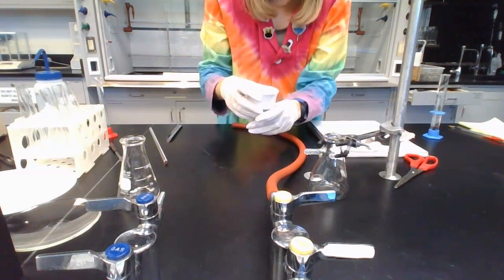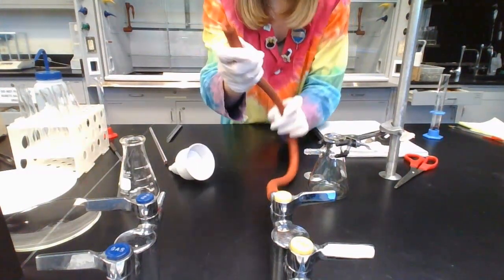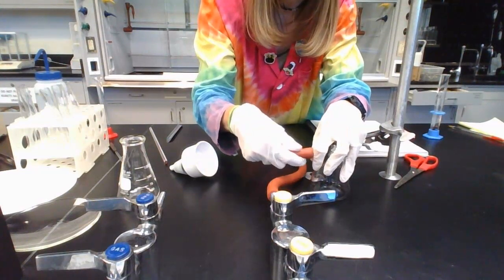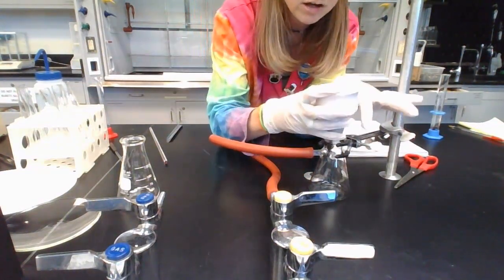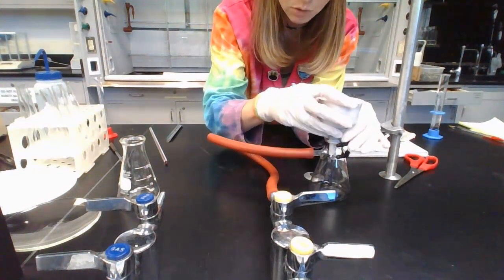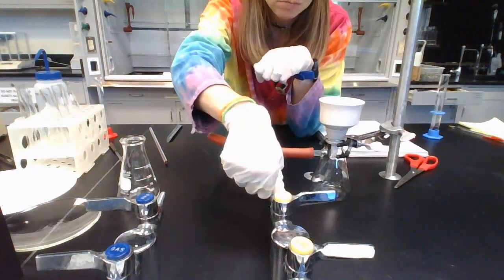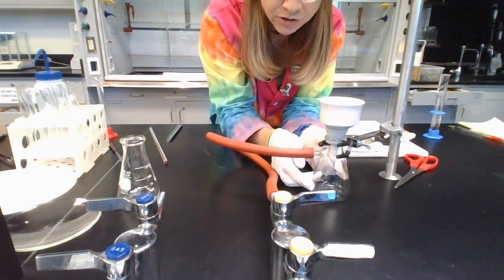Okay. So before we attach this to the filter flask, I'm going to take the other end of the hose. So one end is attached to the vacuum. The other end is going to be attached to the little arm on the filter flask. Okay, so that can make things a little unsteady. So don't put the Buchner funnel on here until you've done that, because otherwise things can kind of wiggle and then it falls off and breaks. Okay, so how this works is when we're ready, we will turn on the vacuum, and then any liquid that's in here is going to get pulled down into the filter flask.